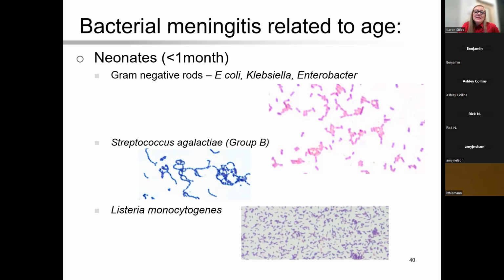So what I would recommend is also having what's called a resource or a reference box.